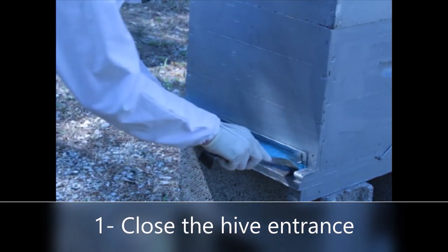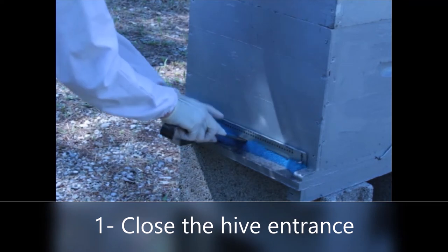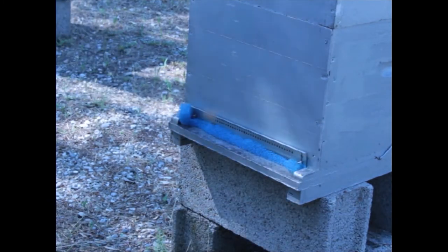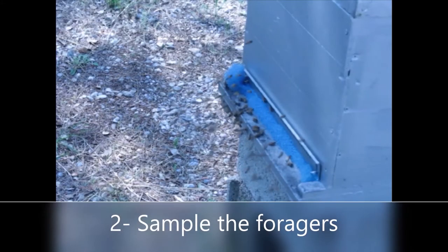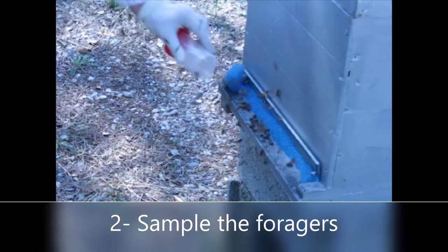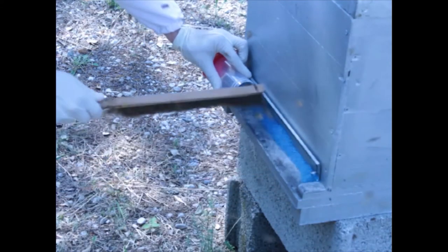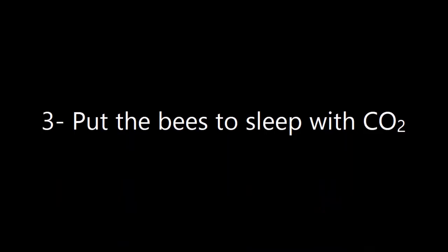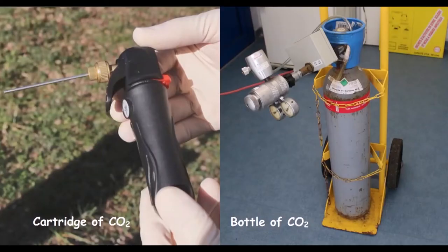The hive entrance was closed. That way, foragers gathered at the hive and could be easily sampled. Foragers were collected. Bees were then anaesthetized, either with a cartridge of CO2 or with a bottle of CO2.